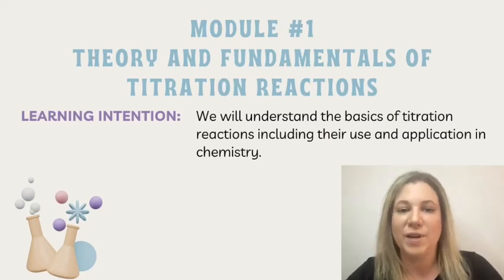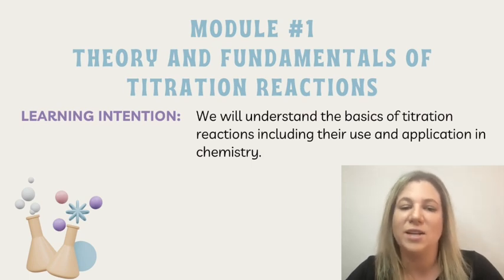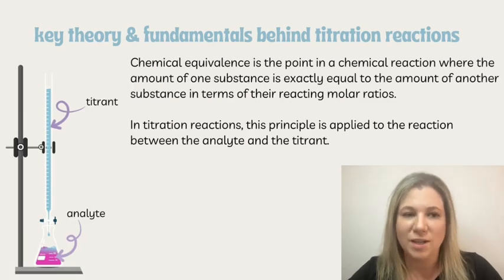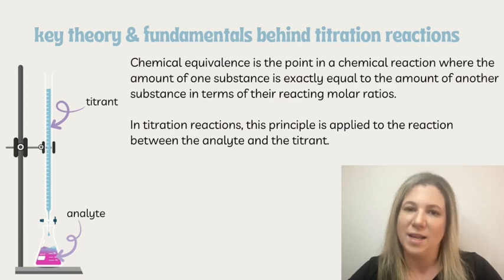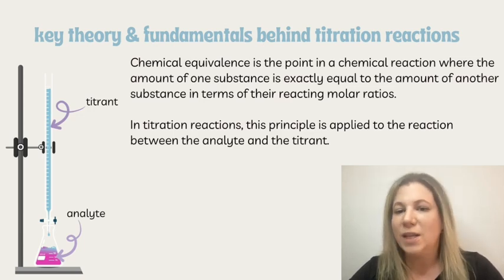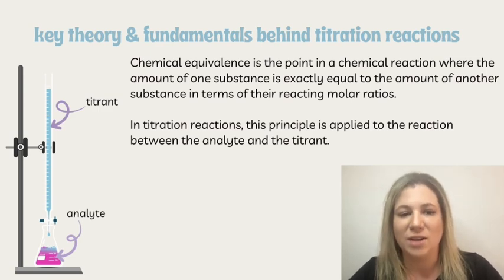In this first module, we're going to look at the theory and fundamentals of titration reactions. The fundamental concept behind titration is based on the principle of chemical equivalence. That is the point in a chemical reaction where the amount of one substance is exactly equal to the amount of another substance in terms of their reacting molar ratios. Really common reactions that we look at are our acid-base reactions and our neutralization reactions.